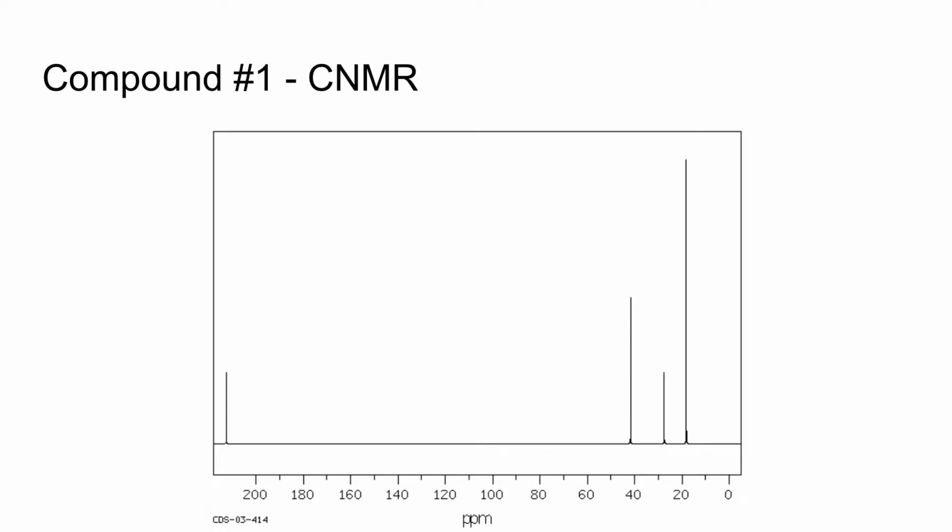What information can we get from this? We have 4 unique carbon environments. Yeah, thanks, Ben. 4 unique carbon environments. Anything else it can tell us if we're looking at particular peaks? Well, the 3 at the end are all alkyl, and you got one at like 220, which is probably a ketone, or maybe an aldehyde, but we haven't got a marker, so probably ketone. So it's really downfield. That's the word we want to use, downfield, de-shielded, because it's probably the carbon attached to the oxygen.